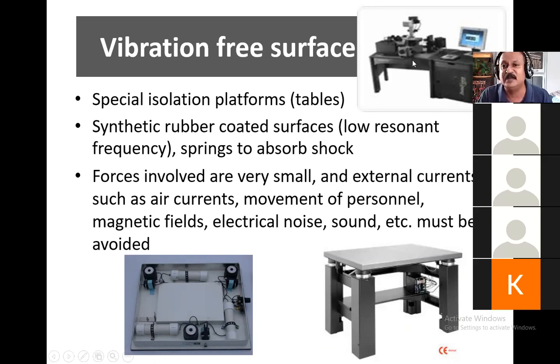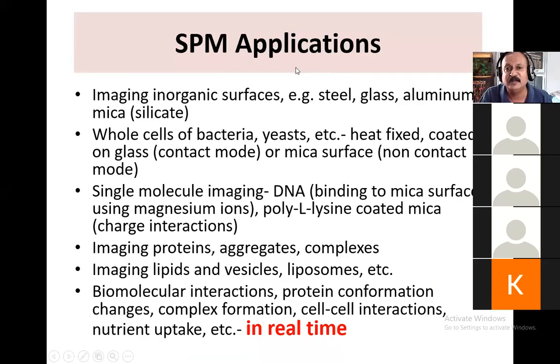On this table, the atomic force microscope is mounted on a normal compound light microscope, on the sample stage, and it is going to scan the sample surface, all in an environment that is totally vibration free. The microscope is actually floating on that table. So even if there are vibrations, they will be absorbed by the surface, and therefore the scanning process will not be affected. Is it right? Okay.